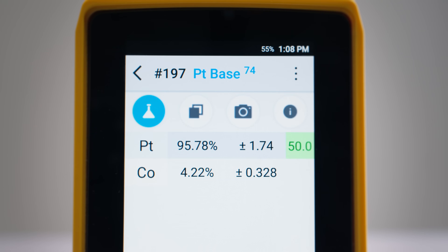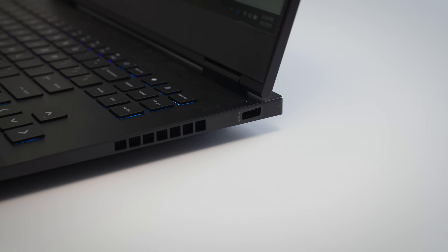If the sample's composition is closer to a standard alloy that the device recognizes — in this case we've tested some platinum — you can see that result in the top bar. And once you've completed your scans, you can connect the analyzer to your computer.